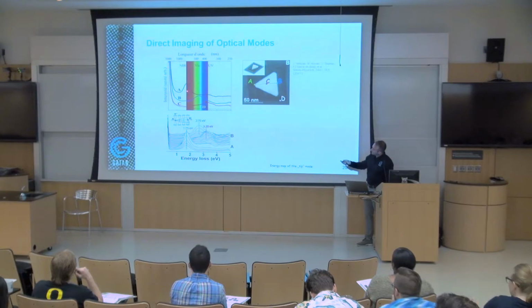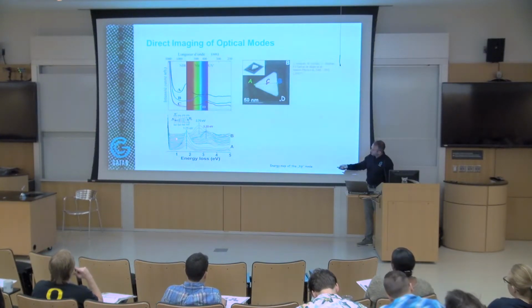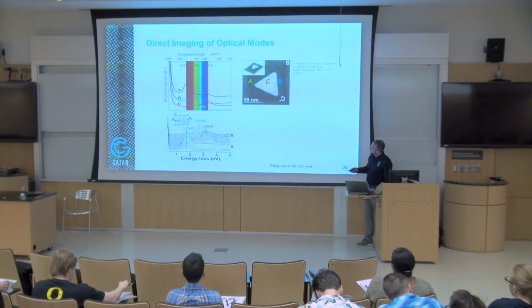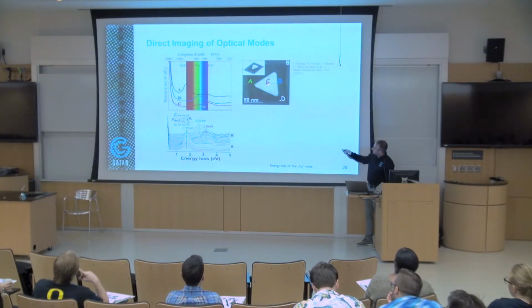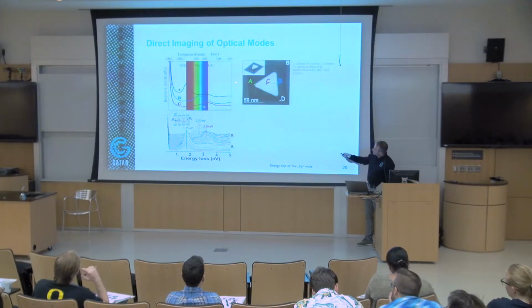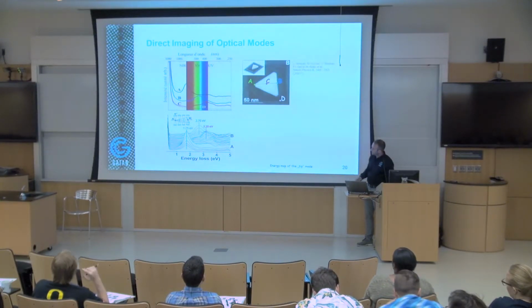You can always relate an optical spectrum with an energy loss spectrum. You can see all these surface plasmons, which correspond to different light emission of your particles. If you take EELS spectra from these three different regions across your particle, regions A, C, and B, you can see that region A corresponds to an emission in the visible. C, which is right here inside the particle, is in the near infrared, going closer to the zero loss peak. And B here is going towards the UV, so it's shifted in energy. Like I said, you can always translate an optical spectrum into an EELS energy loss spectrum, and you can do this vice versa.